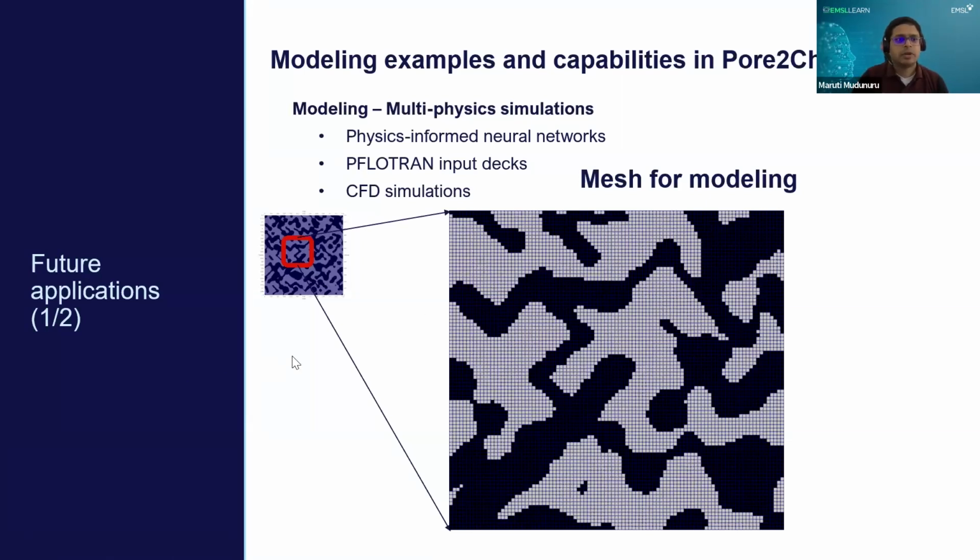And today we'll be talking about building on the Pore2Chip platform. Within the Pore2Chip platform, our team is developing advanced modeling techniques to numerically simulate complex multiphysics phenomena. These numerical simulations are essential to understand and predict how the carbon flows and moves within this micromodel, and how the nutrient intake works within this micromodel for various applications related to rhizosphere function or soil organic carbon cycling.